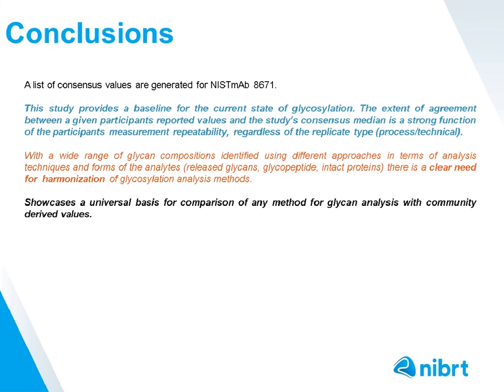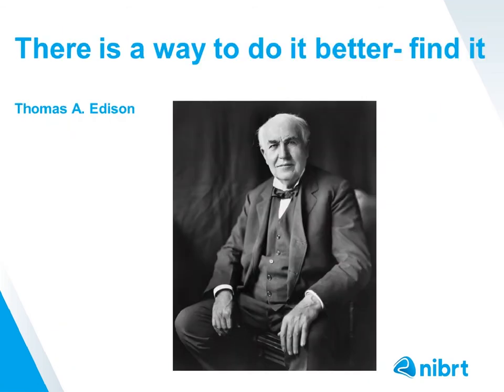So if you remember that table I was showing you with all the different types of identifications that are out there, I think there's a need both for regulators and for us as glycoscientists to try to come up with a more standardized approach, because at present there's so many different types of analysis that you can do. And then lastly, this really showcases a universal basis to compare your newer glycoanalytical techniques to those derived from, let's say, the community. So it gives you some confidence in the technique that you have.